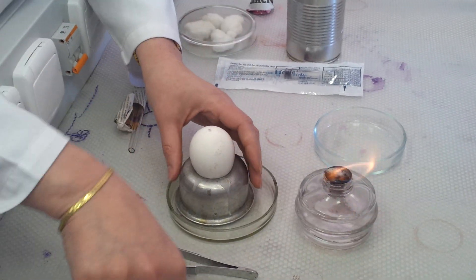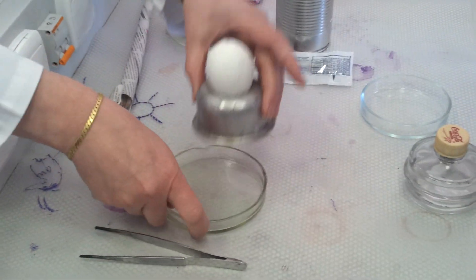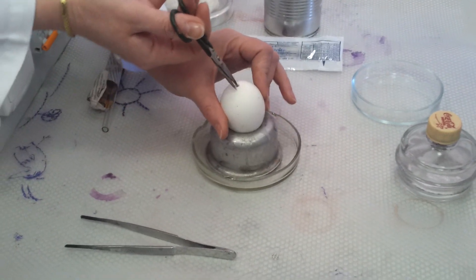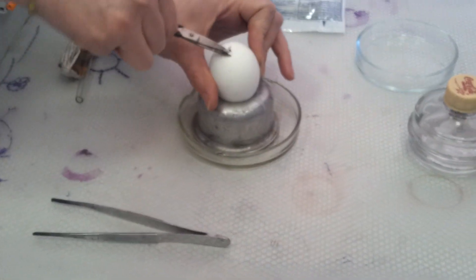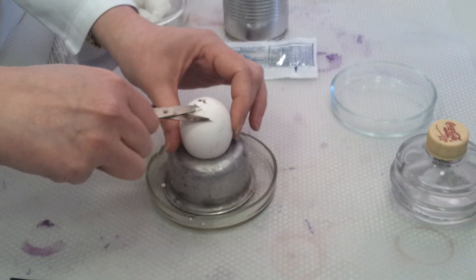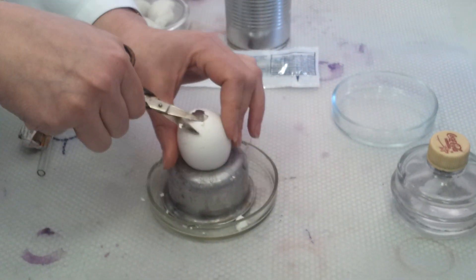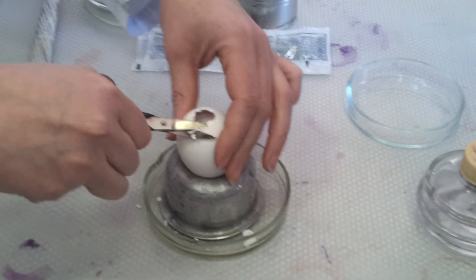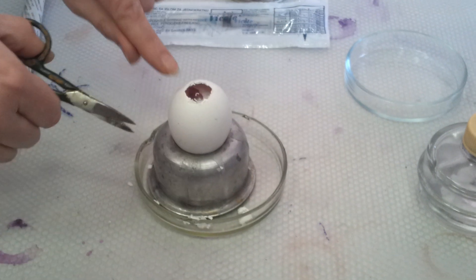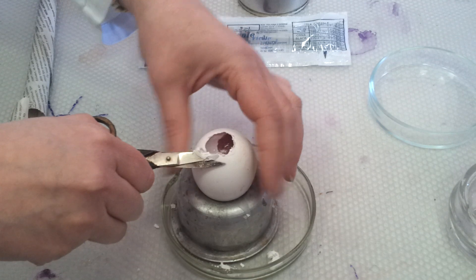I'll open it — I won't do it for real, so I'll close now, because we are not really working with it. I just want to show you what is inside so you know how inoculation occurs. You can see over here is the place where I performed the inoculation on the chorioallantoic membrane.